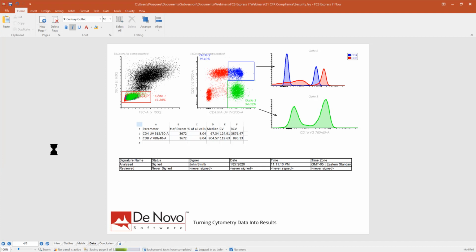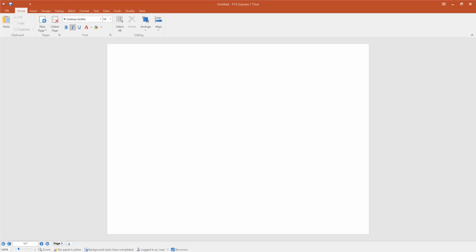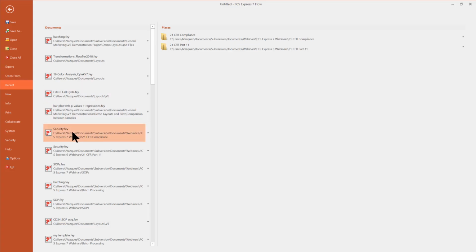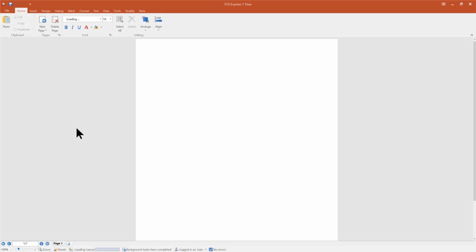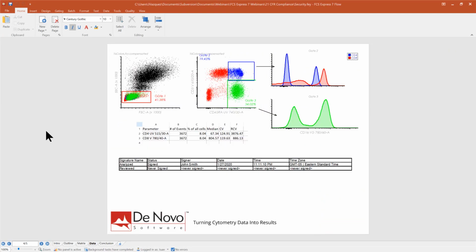Let me save this. So now I can come in and log in as myself, and I can complete the electronic signatures that I need for this layout. Okay.